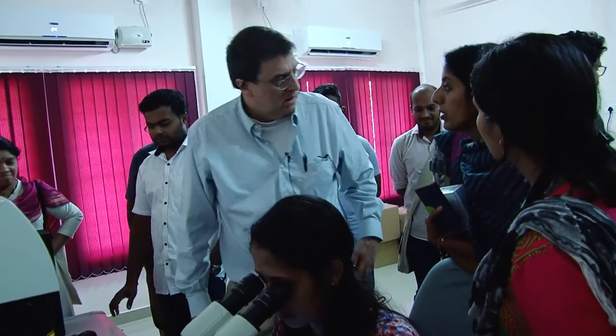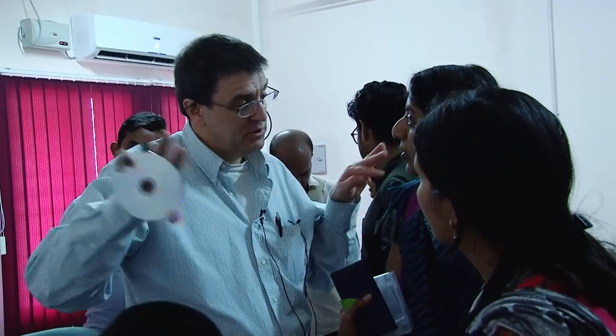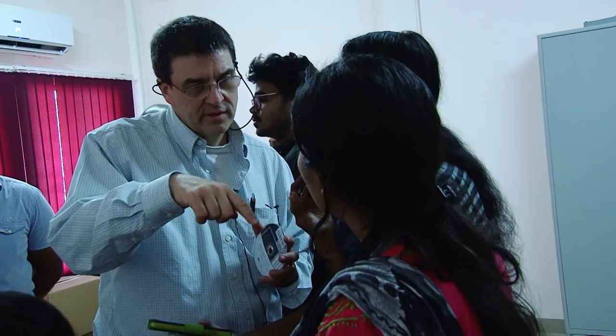And what should be the minimum difference between the nanometers to avoid such kind of overlapping? As far as you can get. Okay. I mean, ideally, you want to go as far as you can go. Ideally. Okay. But you at least want... I mean, what do you have? What do you own? It is something 495 and 498, right? Right, they're two dyes. Right. So what should be the minimum difference between... There is no minimum. Remember I showed you that one thing from Invitrogen? Who's on the internet? You on the internet with your phone?